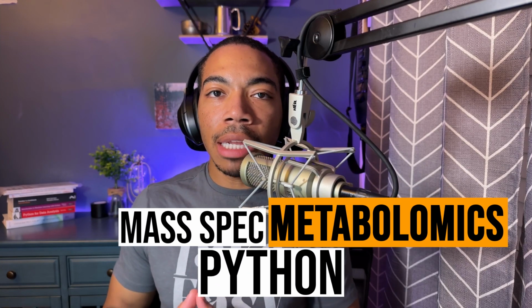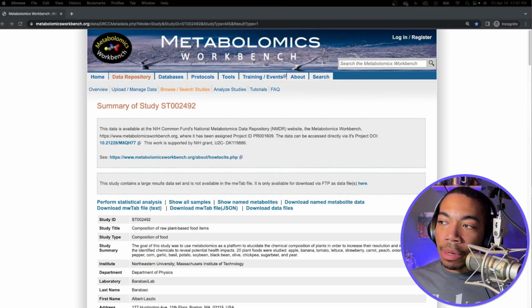In today's video, I've got a really exciting project for you. I've been receiving a number of requests to do more videos where I look at real data and demonstrate how these tools you've been working on will apply to that. And so I will do just that. The real data I will be examining will come from the Metabolomics Workbench.